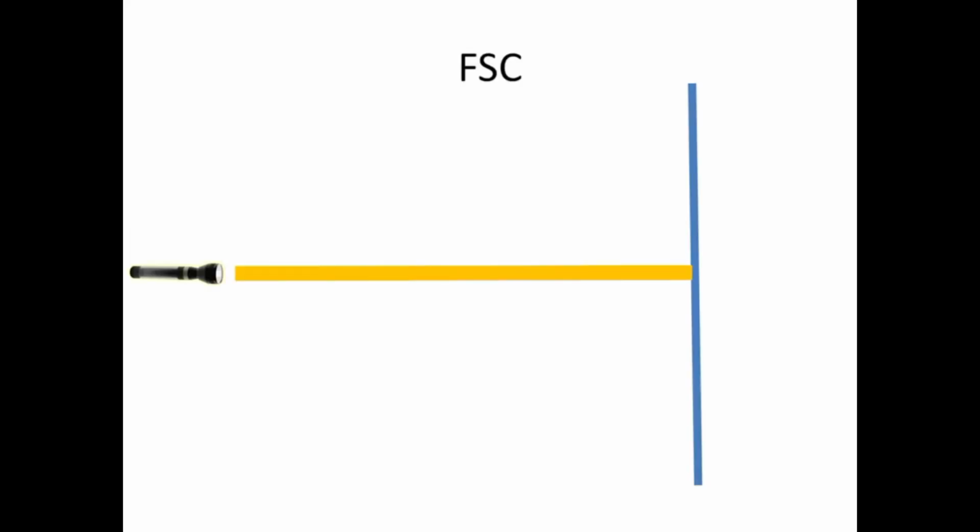Coming on to the forward scatter. Let's say this is a laser light source and it is falling on this screen. This screen is actually a recording screen which can measure the amount of light falling on it and where exactly this light is falling. So when there is no cell obstructing the path, the light will go and fall at this point, and this will be the origin.